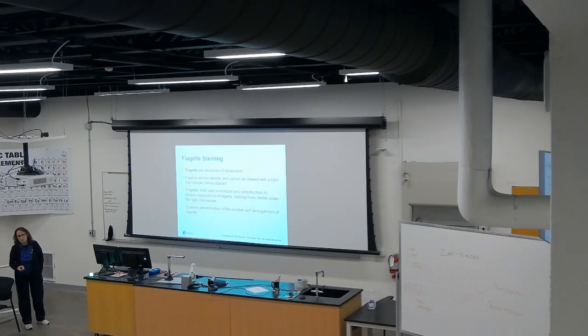Some people use metal salts in the case of light microscopy, which depends on what salt you're using and can sometimes be expensive, but you can use it to study, for instance, the flagella with TEM.